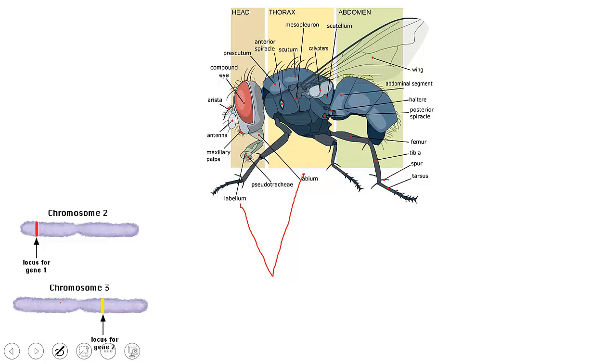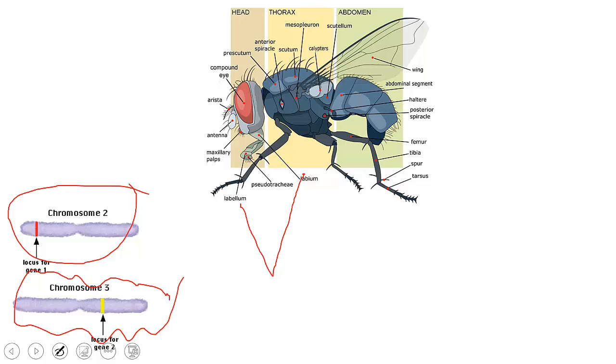We picked fruit flies that carry two different strains of ADH, as I mentioned before. One is a wild type, which has the gene that codes for the production of the enzyme ADH, and one does not have the ability to produce that enzyme. We call the gene that has the ability to produce that enzyme ADH plus, and the one that doesn't have it ADH negative.